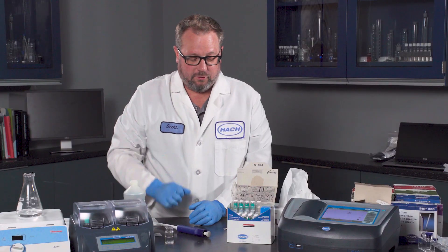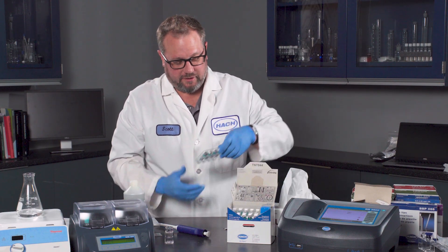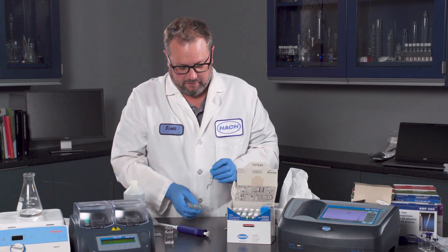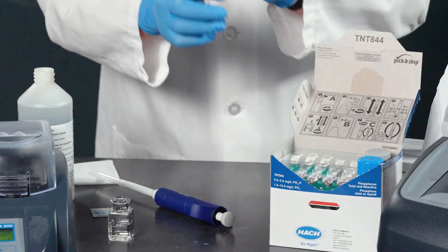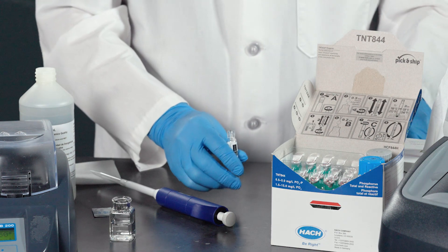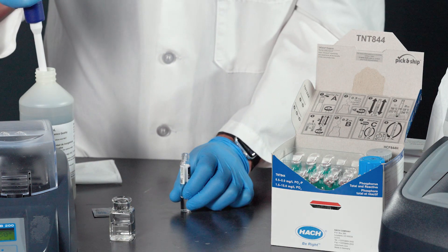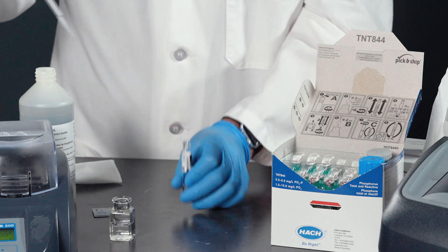Now if you don't want to do total phosphorus and you just want to do phosphate, all you do is take this cap, take it off, remove it — you don't need it — and add 0.5 mL of sample.